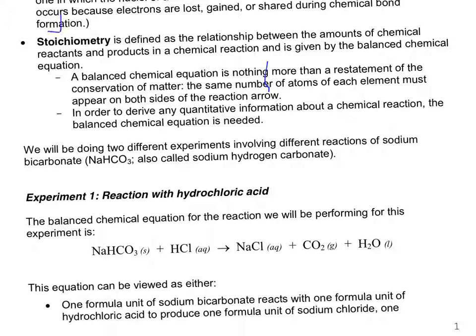So the first experiment you're going to be using, I think it's 3 molar HCl. It's in the first hood. And this is what you're going to be producing. Just to give you a precursor with your first experiment, you are going to stir the heck out of your product to drive off all of the CO2. That's kind of in a nutshell what you're doing.